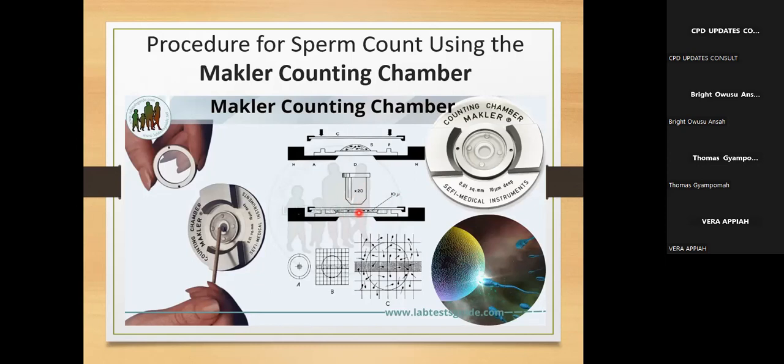So in proper microscopy usage, you have to always make sure that once you are removing your slide in and out of the stage, you should always have the times 10 in position. Like I said, the distance between the objective lens and the slide, and for that matter the stage, is what we call the working distance. The working distance decreases with increasing magnification. So as the magnification is increasing, the distance becomes very, very short. So in between the 40 and the 10, you have times 20. Most of us don't use our times 20 objective. Normally, we use the low power, which is times 10, and then the high power. But there is the times 20 there.